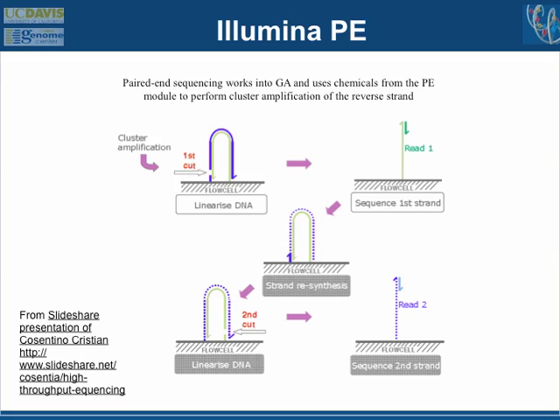I mean, people play with the chemistry all the time to figure out other ways to do it. But imagine you have a 20,000 base pair piece of DNA. It's flopping around on your slide surface. It doesn't bend over and find the primers that are nearby it. It can reach over to some other spot, and the reaction doesn't work. You don't read the sequence very well. So most of the time, people do about 100 to 300 base pair pieces of DNA.